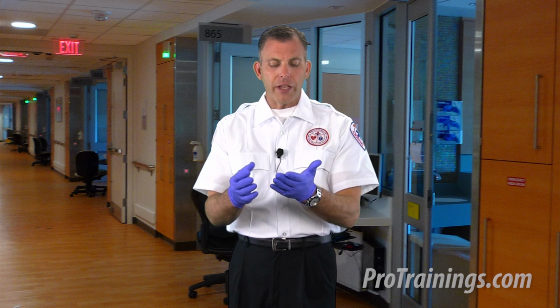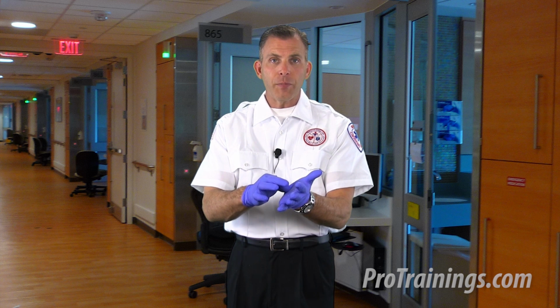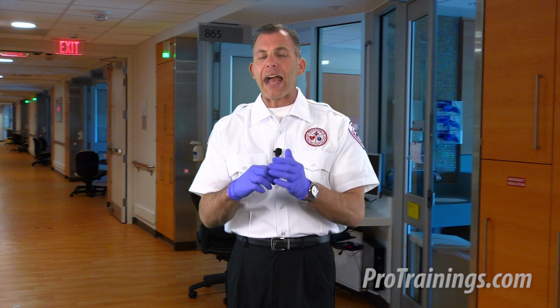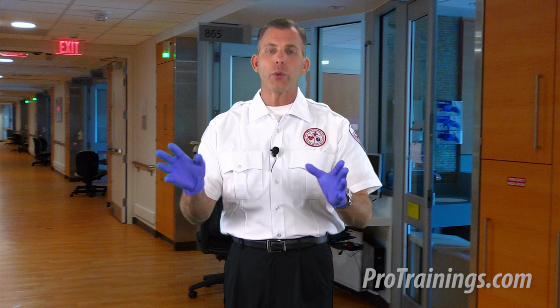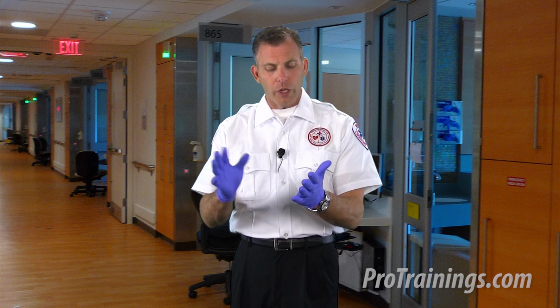In this process, it's important that we keep the contaminated materials on the glove side and the non-contaminated to our skin side. But when we remove these gloves, we want to make sure that we're not accidentally snapping or popping the glove, which could run the risk of then nebulizing or spraying the blood on other surfaces or into other colleagues' eyes. So here we go.